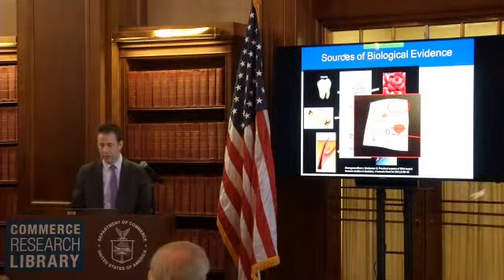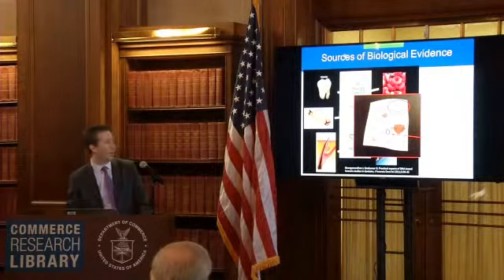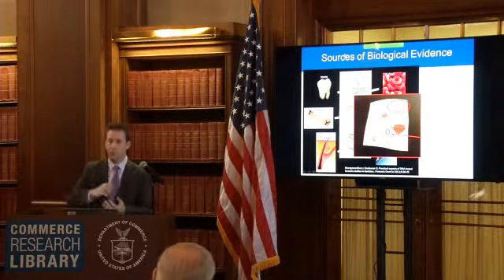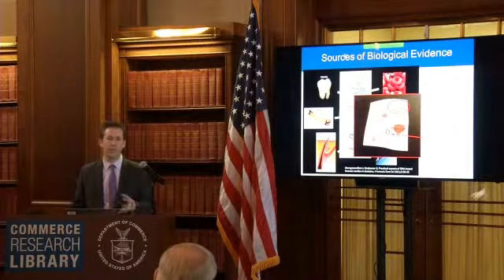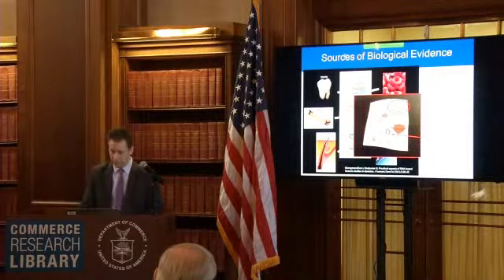The idea here is that only a very small amount of blood is needed for a DNA profile. This is just a piece of paper with a dime for reference, but even this really tiny spot here, you could punch that out, put that into a tube, and develop a DNA profile off of that. In essence, you really need a couple hundred copies of the human genome to perform one of these tests. They're quite sensitive.